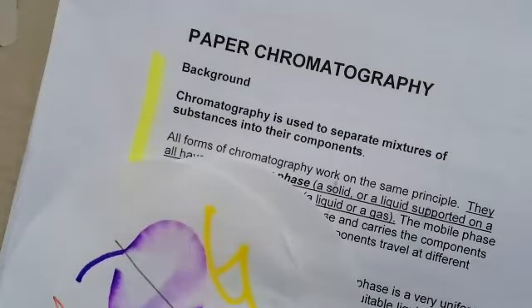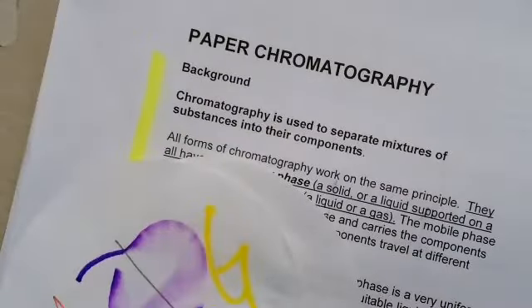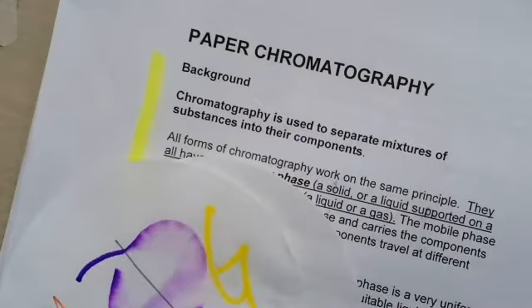The goal for today, so I know I gave you 2 packets. Everybody have 2? So we should have this that just says paper chromatography, and then another one, a laboratory introduction to chromatography. We're all good. So first, this paper. I want to make sure we understand the theory. Then we'll transition into, okay, what are we exactly doing in this lab? Oh, did I give you 2? I'm so sorry. One extra one for good measure. And then we'll talk about the goal that we have.